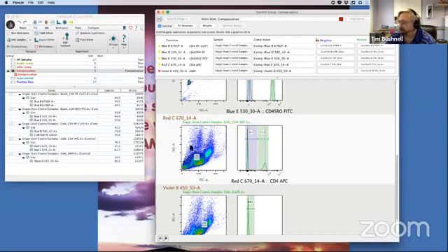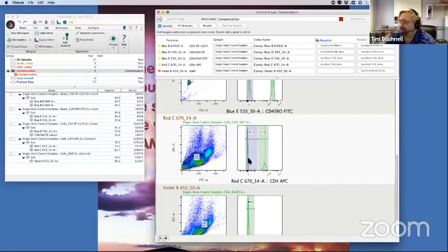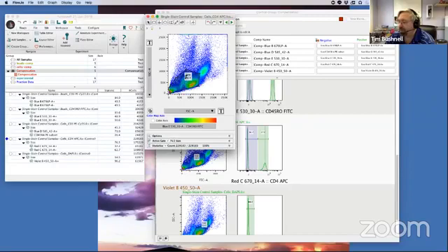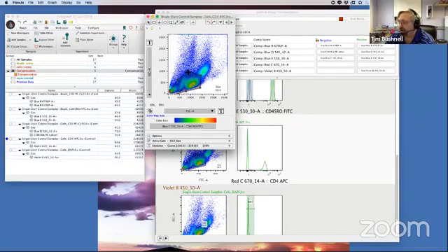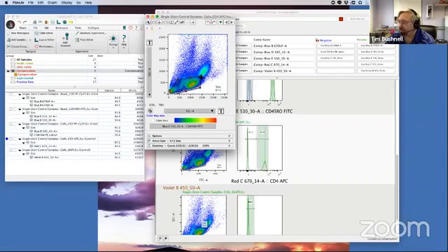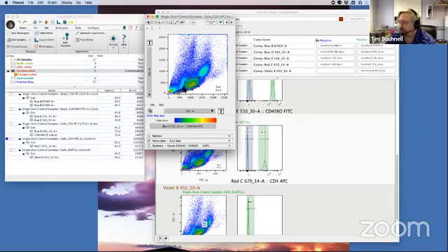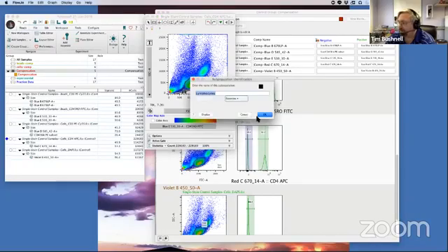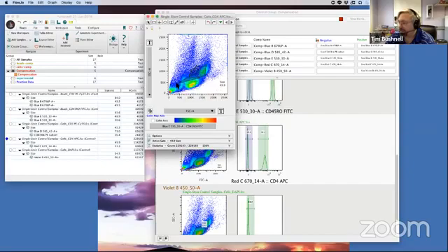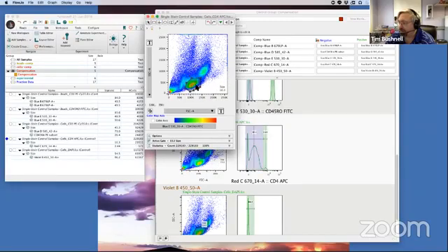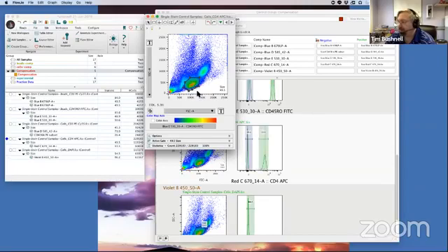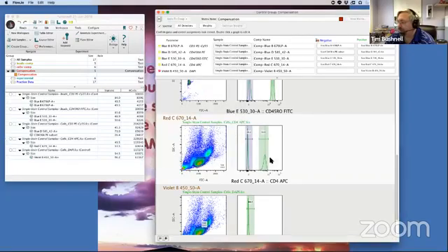So let's go down to our next one, our fluorescein. Again, nice beads. It looks really good. Our red channel. So again, it pulled all that together. We don't really like that, and it has identified a positive or negative. So let's go back in here. And again, let's readjust our gate. And this is one of the downsides of using wizards is you really have to come in and check everything, make sure the software algorithms have found the right populations that you're looking for.